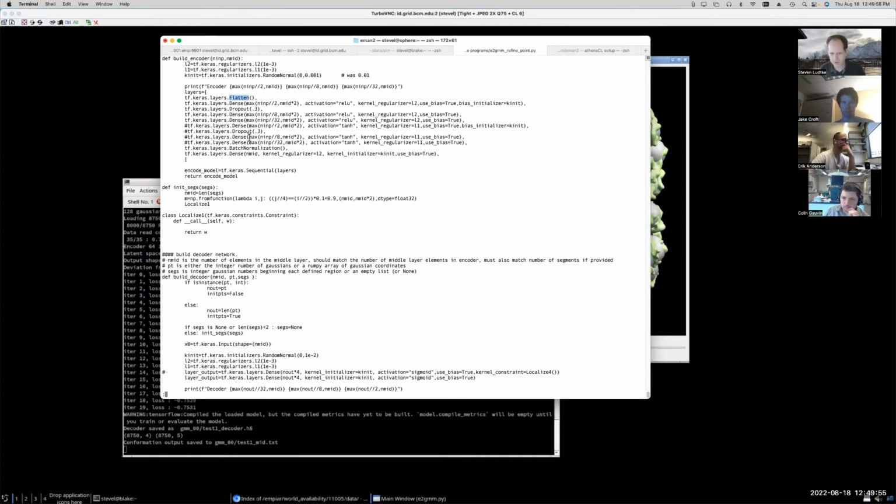And when the output of this, oh, actually, sorry, yeah, these are commented out, right? So just these layers here. And then the output of this is not going to be the output of the overall network. This takes us to the middle. So the encoder takes the input to the network and brings us to the center. And then the decoder takes us from the center and gives us the final output. And the reason we define that as 2 separate networks is because we want access to the values in the middle of the network directly. And this gives us a nice, easy way of doing that. If you just put it together as one single network, then it would be more challenging to get access to those values in the center.